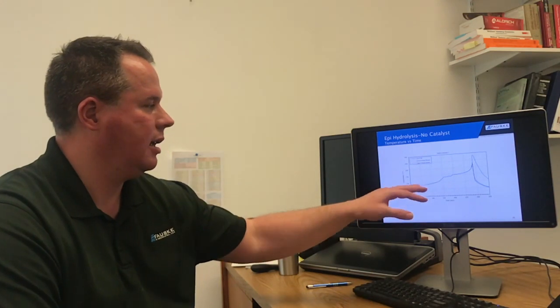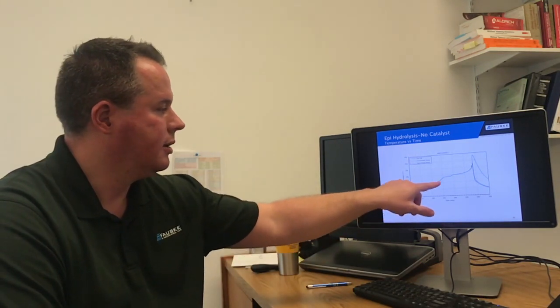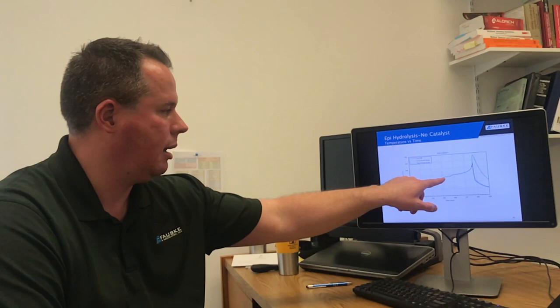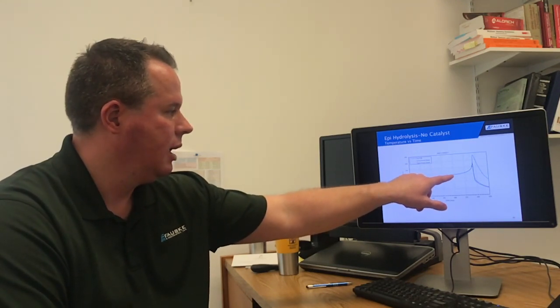Now in this case, instead of allowing it to cool, because I noticed some reactivity at the end of the other test, I wanted to search and see if there were any other reactions to be concerned about. So I began a heat-wait-search routine. We heated up to, I believe, 140, and then 145.